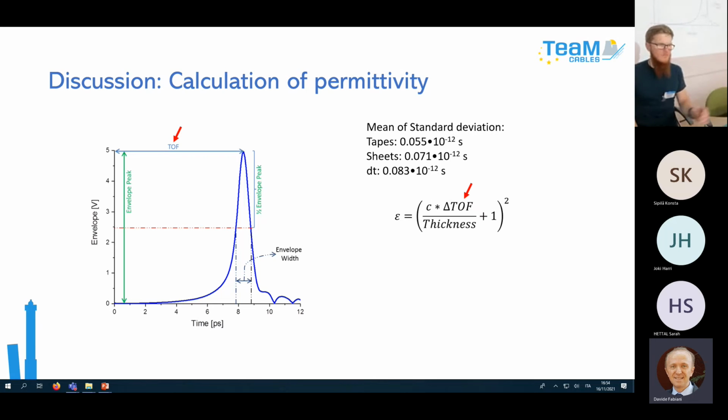But there's a lot of work behind that because we basically have to automate the sample head, the probe head. Yeah, that's not easy. Especially in multiple axes. And we try to fix that or to measure how perpendicular we are. There are lasers at three positions around the head, so we have an area and you can know how perpendicular we are. That's what we use at the moment. Okay.